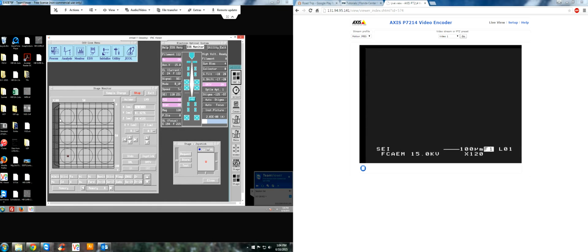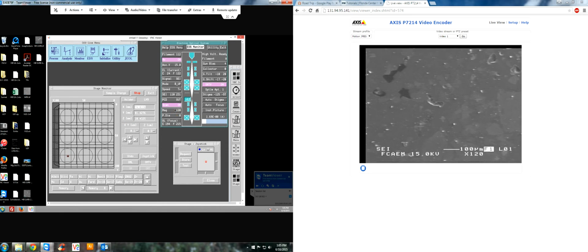Let's pretend right now on the stage we're located at an unknown sample. In my previous standardization video, we standardized olivine, so naturally on this unknown sample, which is a basalt from southern Chile, specifically Volcán Planchón, just on the crest of the Andes, southeast of the capital city, Santiago, this sample has olivine, and that's what we're going to analyze. So let's open up the Faraday cup on the EOS monitor. The scan generator's on, so we should see our video here.